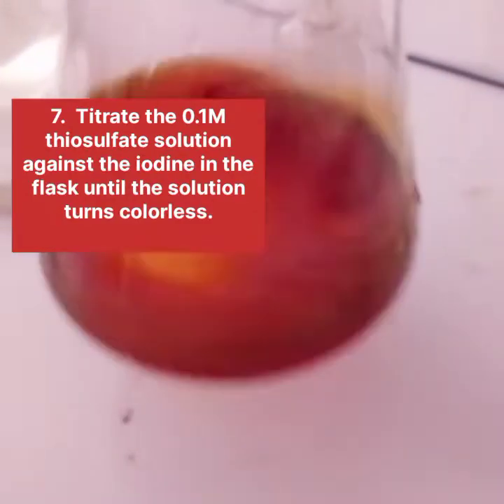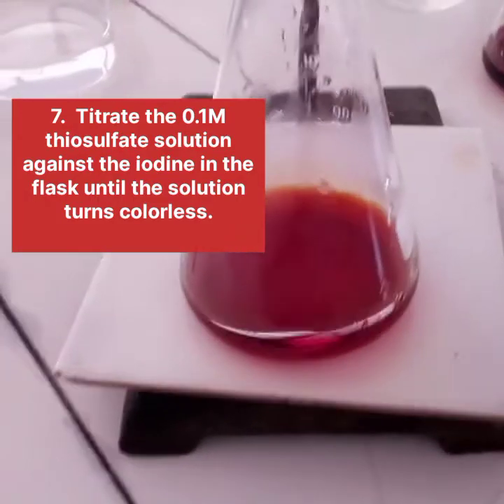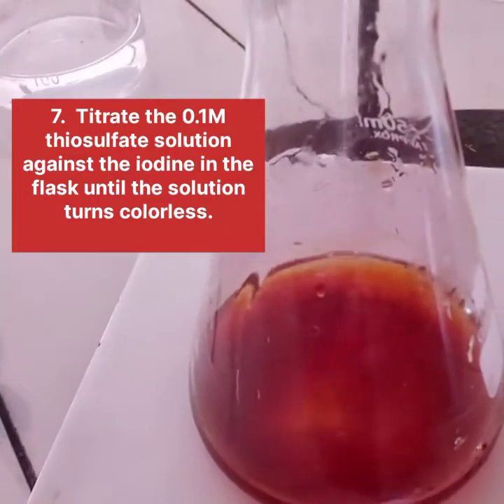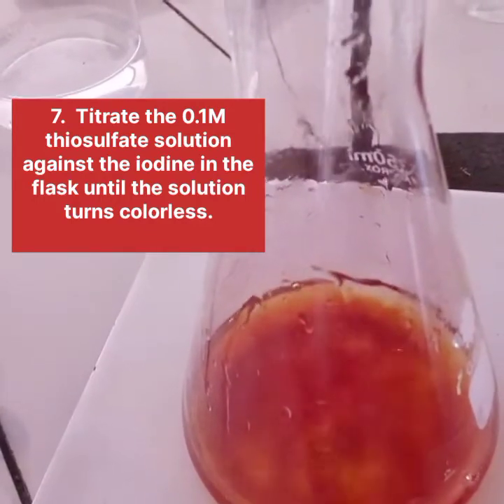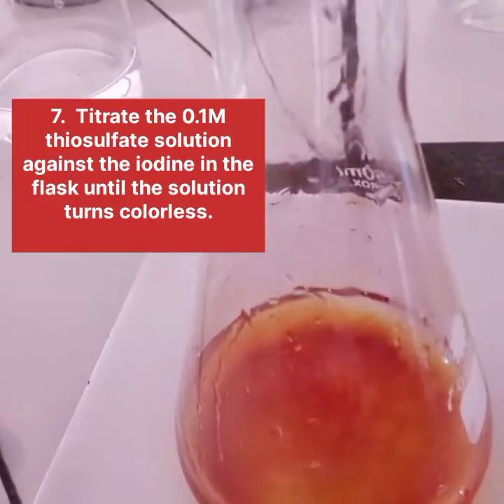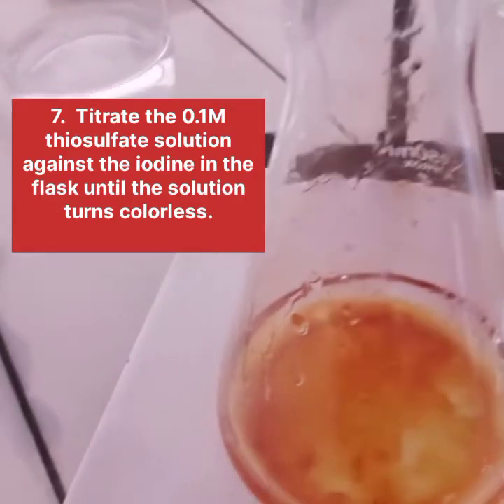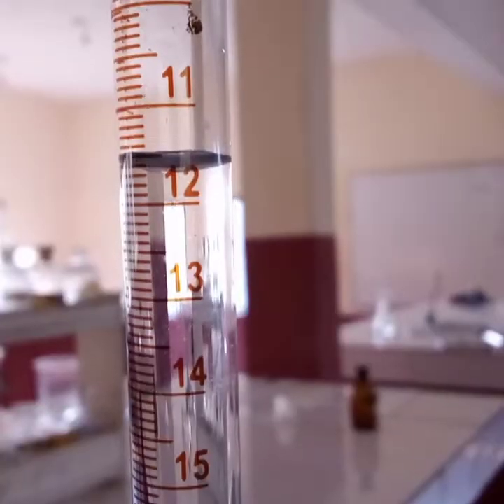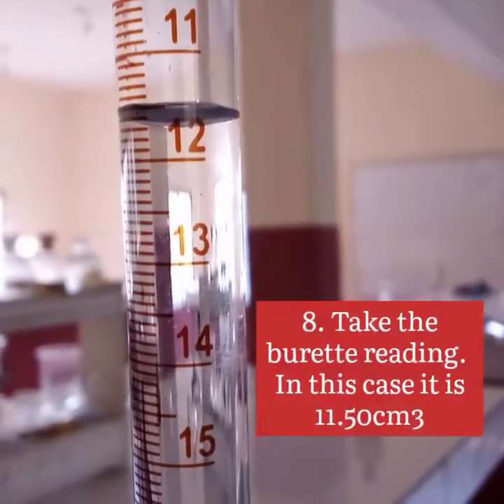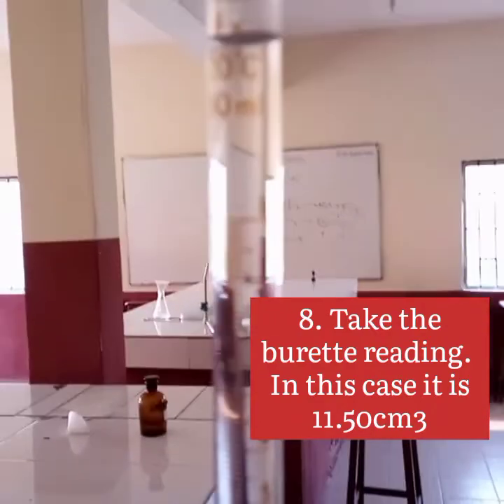The next thing is to titrate the 0.1 mol per dm³ thiosulfate solution against the iodine in the flask until the solution turns colorless. Take the burette reading. In this case it is 11.50 cm³.